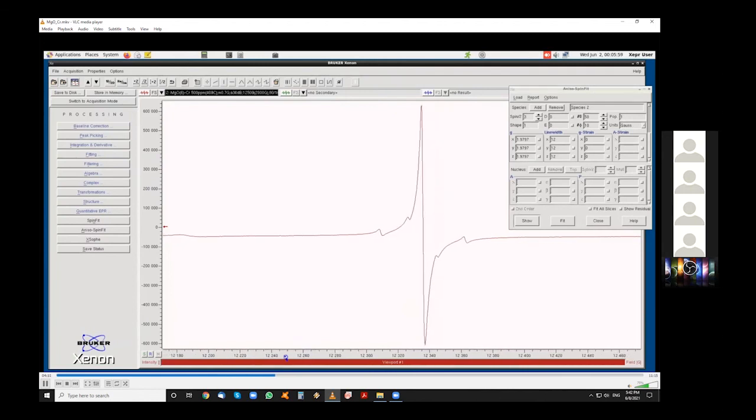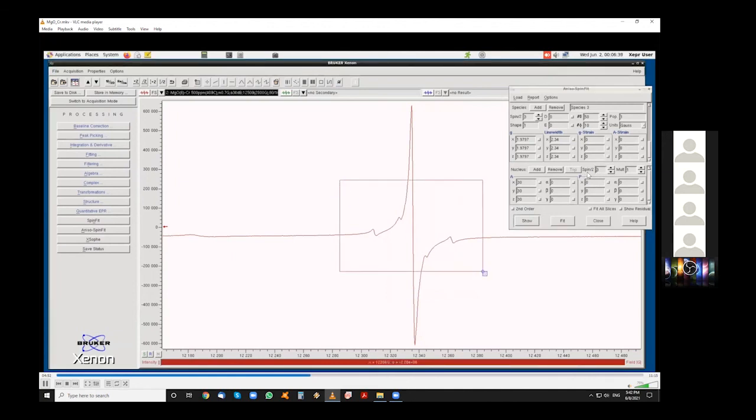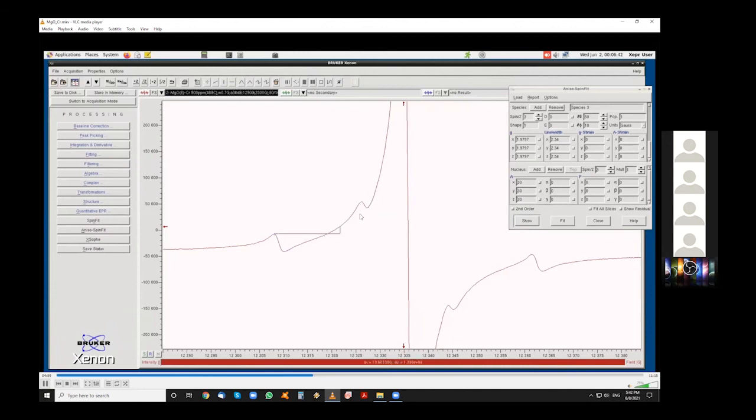Okay, so I think we can skip a little bit these steps. And now the last center has the same G value and line width as the previous one, but I add the nuclear spin, and I've also measured the hyperfine splitting. The delays are because of the remote operations. Usually it's working much better than this.